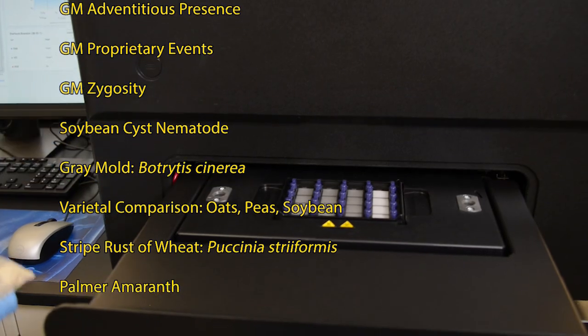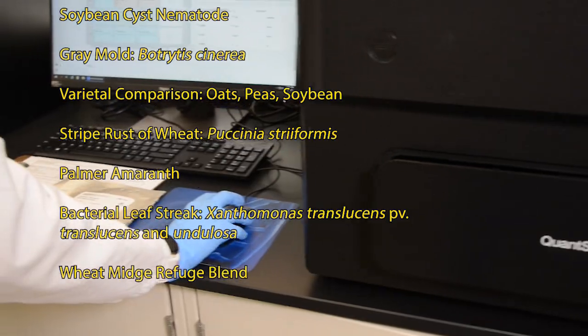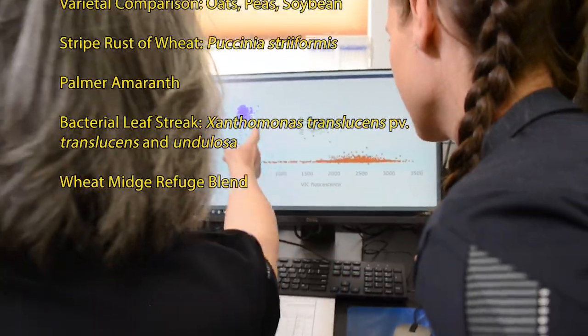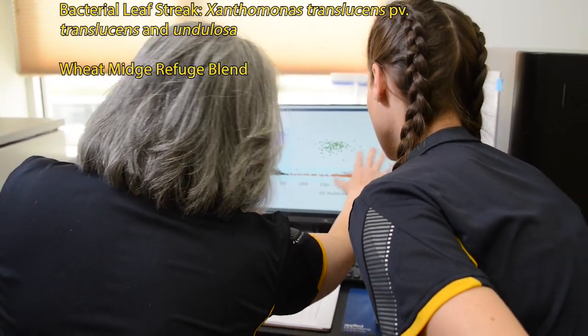From our pioneering Fusarium graminearum and club root qualitative detection by conventional PCR to sensitive and quantitative qPCR analysis of club root and bacterial leaf streak pathogens, to precise linear quantitation by digital PCR such as used for wheat midge refuge blends.